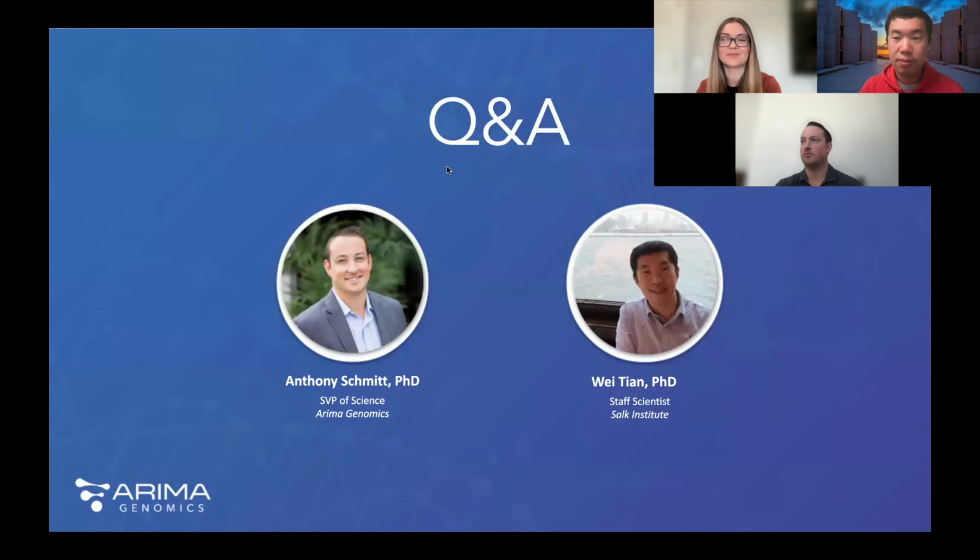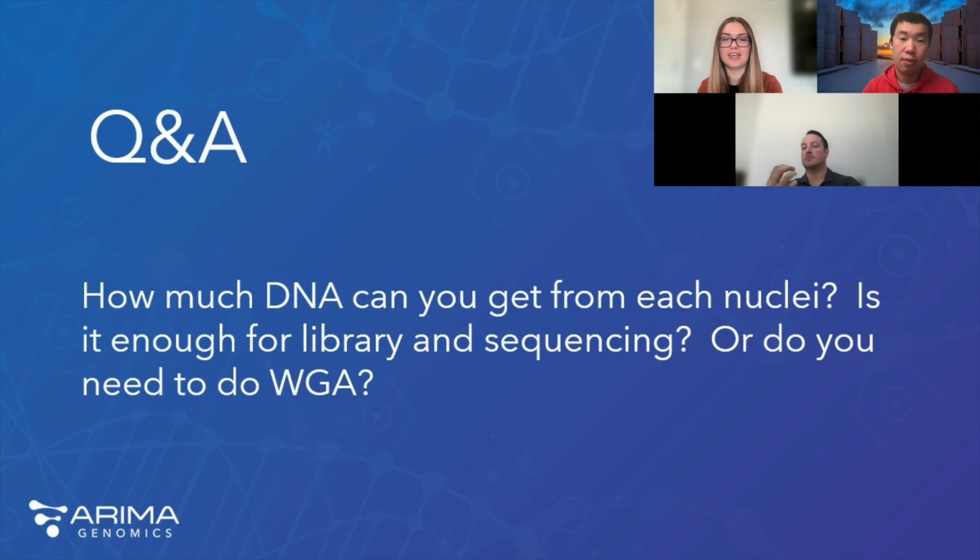Thank you, Wei. Let's go back to the Q&A because I see quite a few questions. Again, upvote the questions that you like. I'm going to start with the first upvoted question from Jason. How much DNA can you get from each nuclei? Is it enough for library and sequencing, or do you need to do WGA, whole genome amplification?